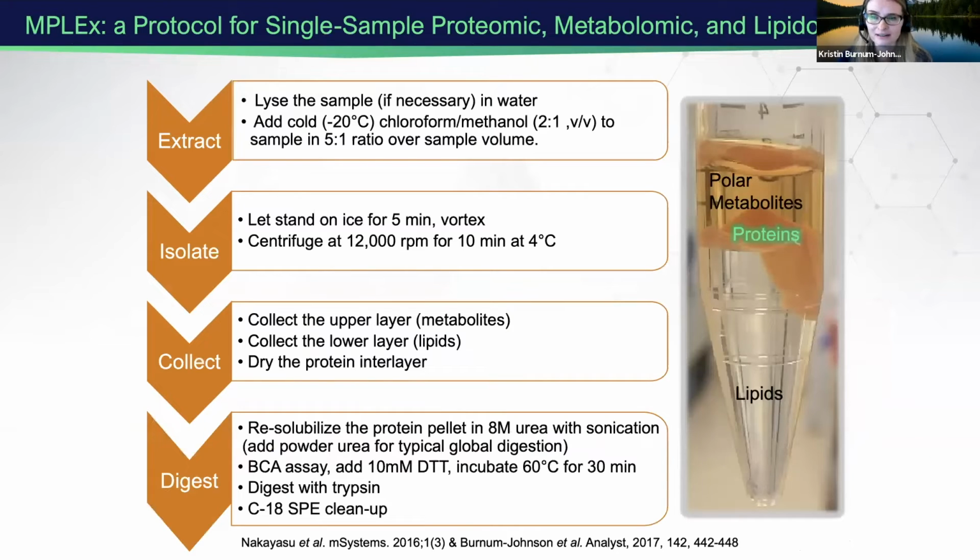Now, I want to start discussing some more details about our proteomics workflow. So this slide depicts our MPLEX protocol for single sample proteomic, metabolomic, and lipidomic analyses. If you look at the picture on the right, the top metabolite and bottom lipid fractions are removed for metabolomic and lipidomic analyses. Then the proteins, or that protein disk that you see there, is further processed.